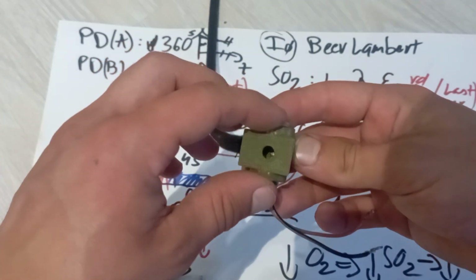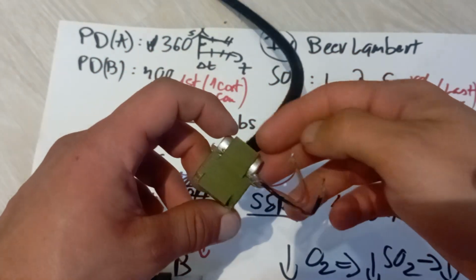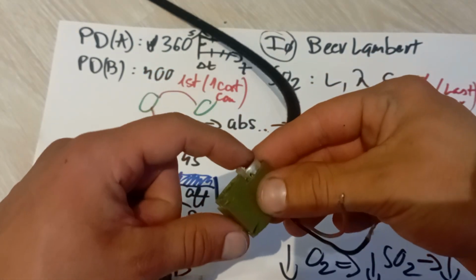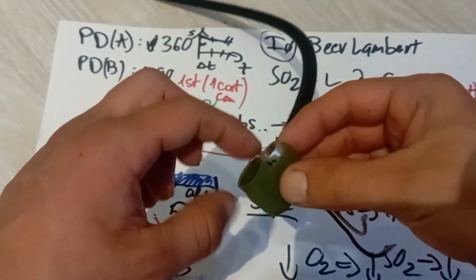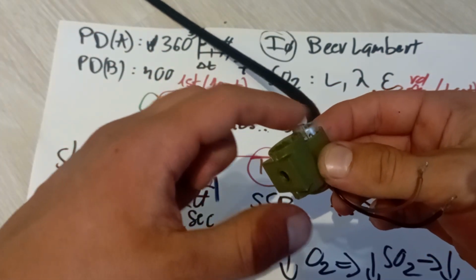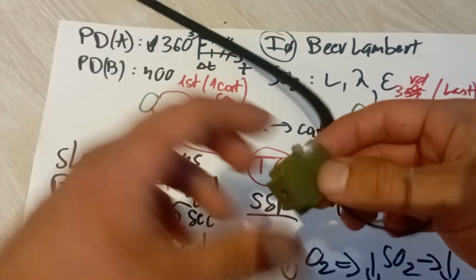And here we have at last the little box. We have a tube here that is like a cooling casing, and this was the original LED. It had this long tubing, and it has a slide in, slide out little thin bar.